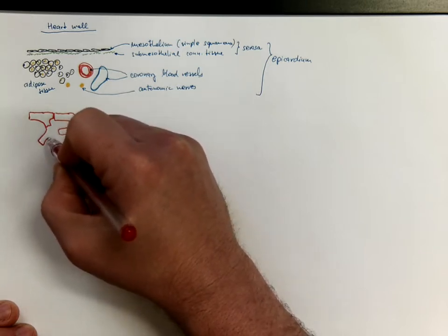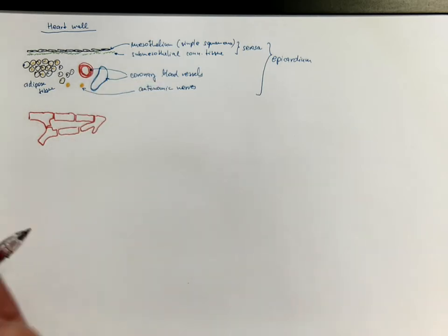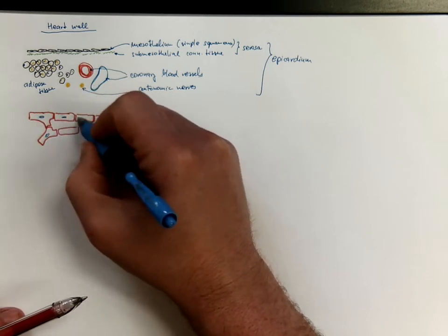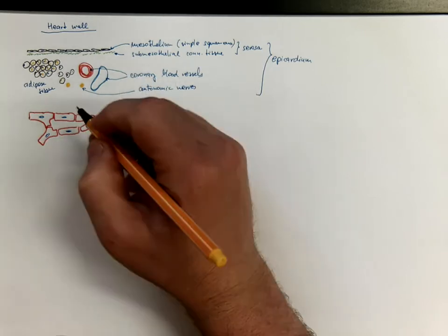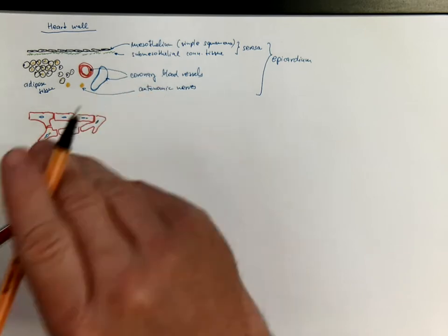They form a three-dimensional network. Each cardiac myocyte has usually a single nucleus in the center. Exceptionally, there might be two. On the poles of the nucleus, there is usually a pigment called lipofuscin.